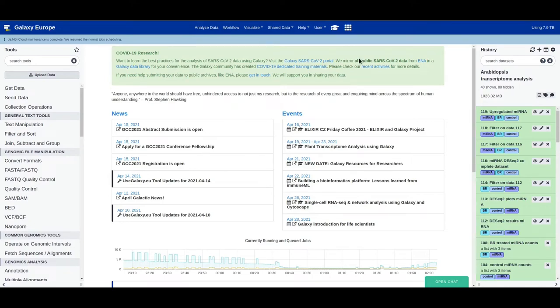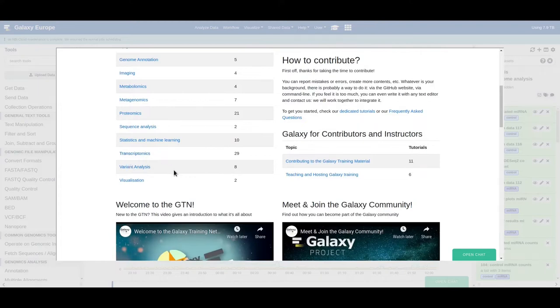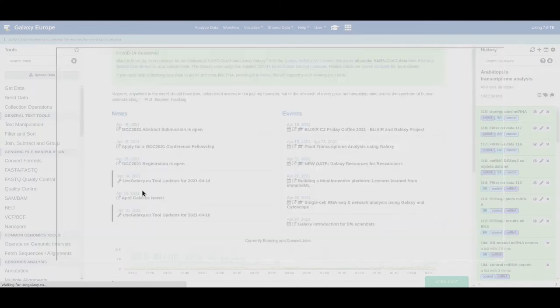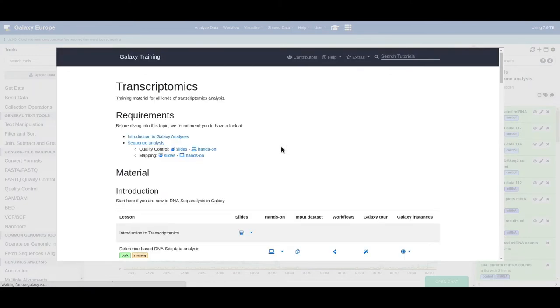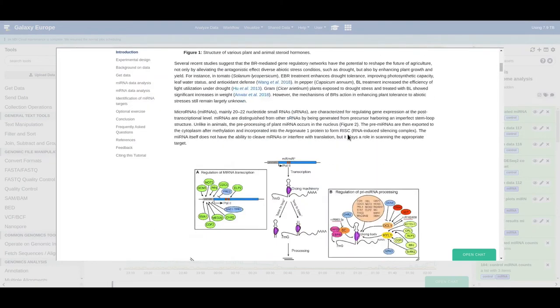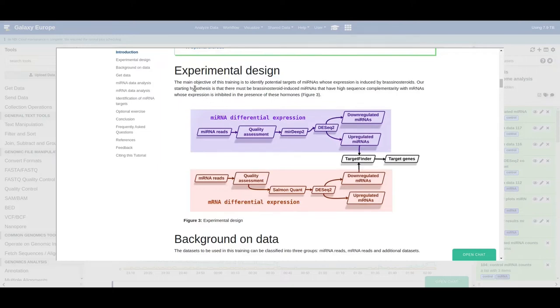Hello everyone, let's continue with the remaining tutorial of Arabidopsis whole transcriptome analysis. You can always quickly access the training material from here — first scroll down and click on the transcriptomics topic, then go to the bottom of the page where you can find our hands-on.